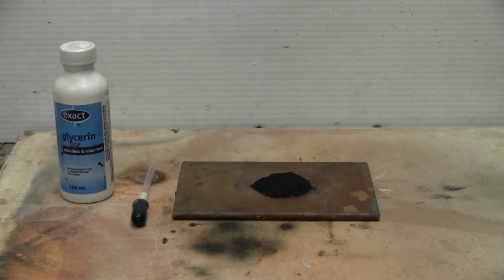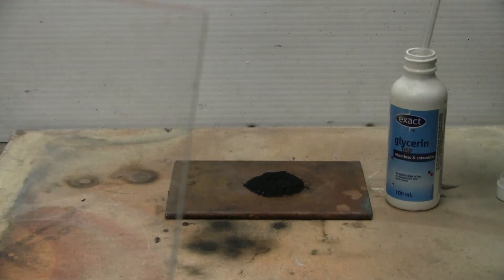This video is about the very exothermic reaction between glycerin and potassium permanganate. On the copper plate, I have some potassium permanganate, about 3 or 4 grams. I have some glycerin in a bottle and an eyedropper. I'm going to place a few drops of glycerin onto the potassium permanganate and we'll see what happens and how long it takes. Let's add the glycerin and get started.